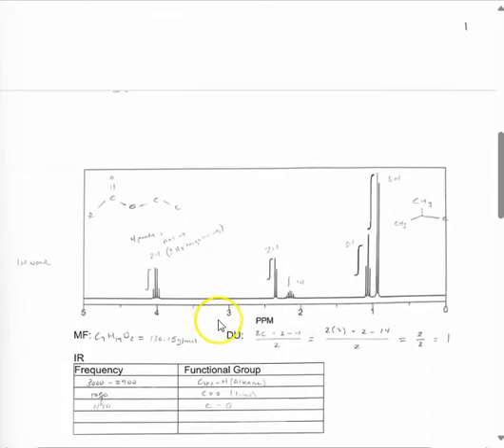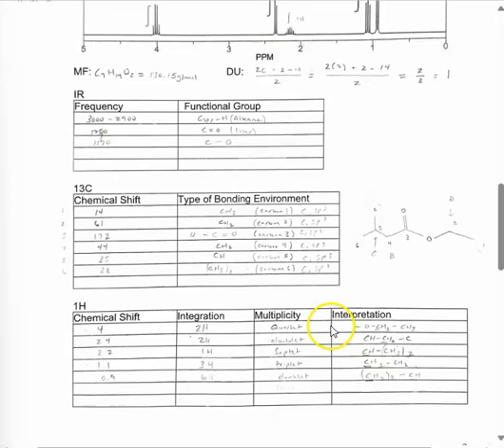As we scroll down very briefly, carbons labeled 1 through 6 only indicate how much further removed they are from the electronegative atoms. So here we have carbon 1, 2, 3, 4, 5, and 6, and I have those labeled over here onto the table as well. As you can tell from the chemical shift, it is more upfield the further they are away from that oxygen.